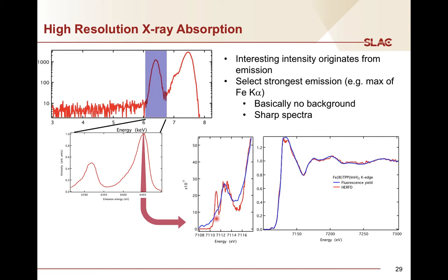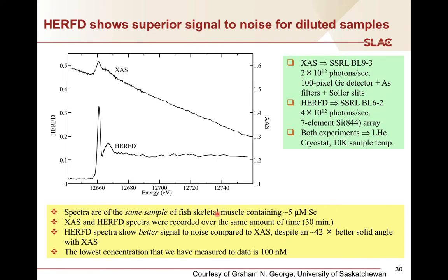So you have basically no background. I compared the background here, it's at 0. Because we have 1 eV resolution, we're not sensitive to anything outside that energy. And you get very sharp spectra. And this background actually is a very important point here.